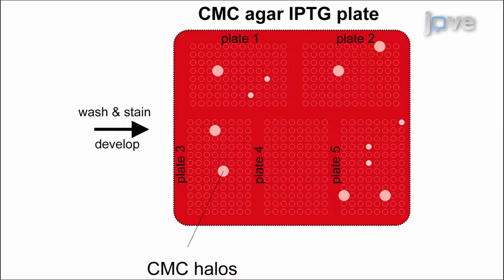This assay produces unambiguous results as zones of degradation at the colony site, where halo size correlates with enzymatic activity and allows qualitative assessment of relative protein fitness. The main advantage of this technique over existing methods, like the overlay method, is that it allows high-throughput analysis with a very low false positive rate.